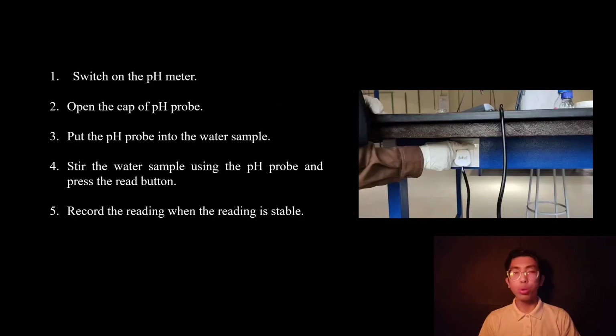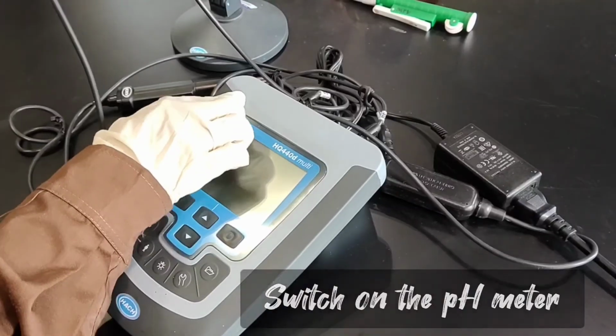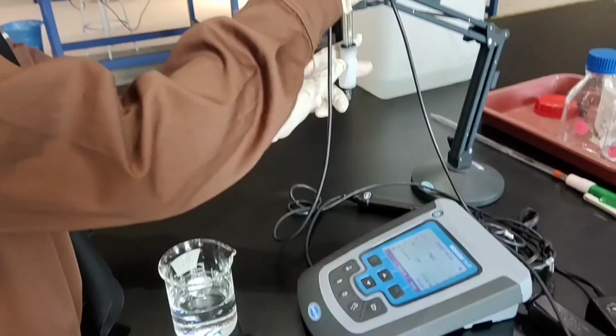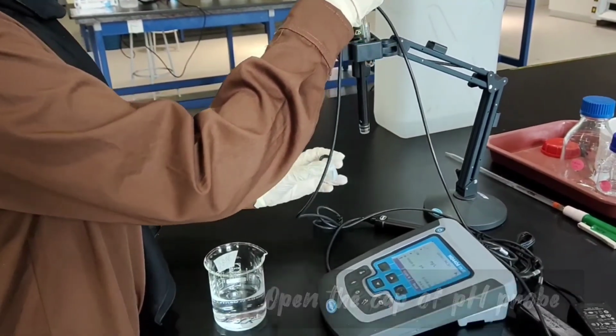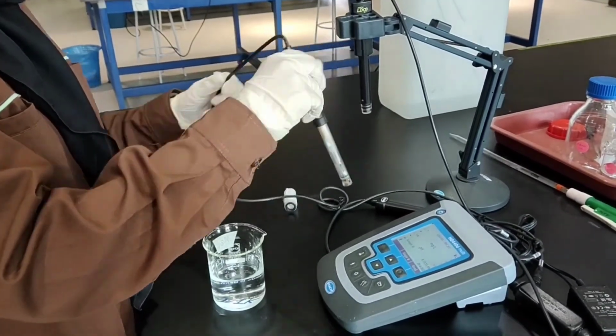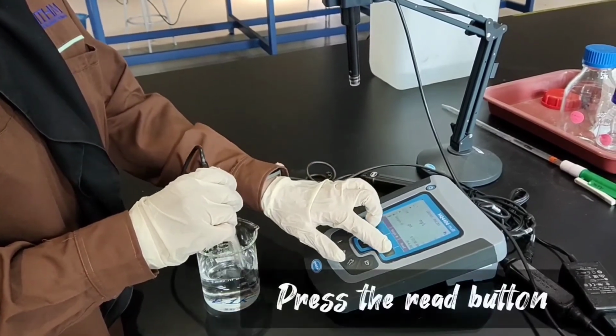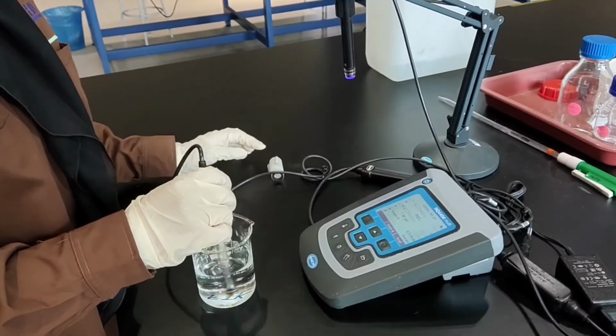So how to use the DO meter and pH meter? The video will show you how to use them. Both meters use the same steps, but for the DO probe, there is no need to open the cover. First, switch on the pH meter. Open the cap of the pH probe. Put the pH probe into the water sample and stir. Press the read button and record the reading when the reading is stable.